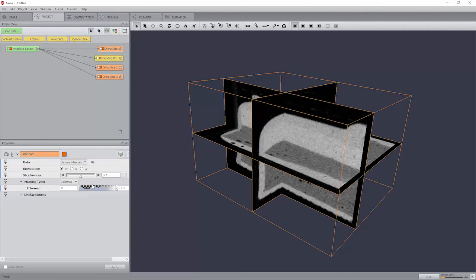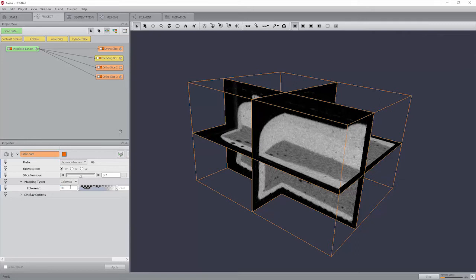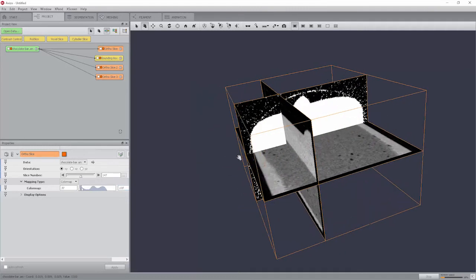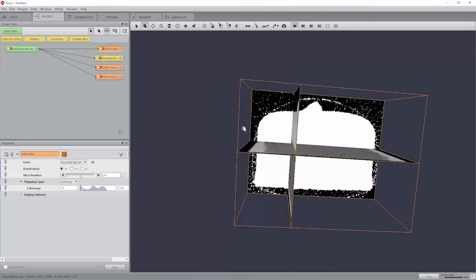The values of the color map port of the ortho slice module determine which scalar values are mapped to black or white, respectively. If you choose a range of, for example, 30 to 100, any value smaller or equal to 30 will become black, and all pixels with an associated value of more than 100 will become white.